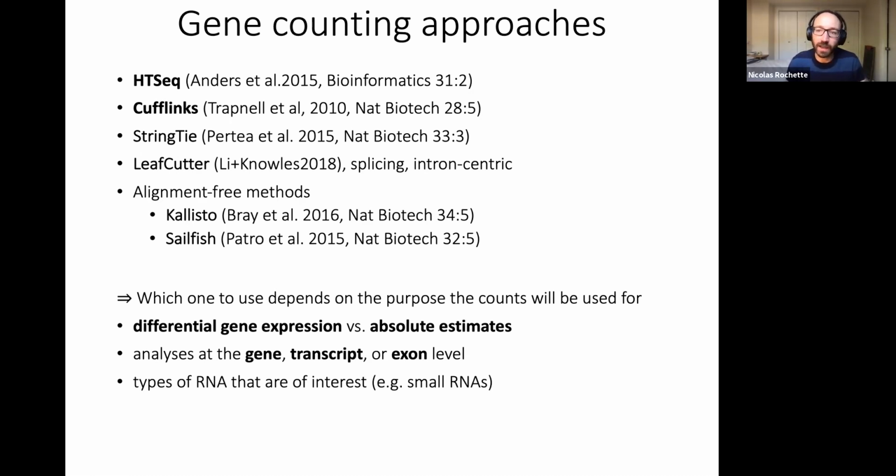They're not asking exactly the same questions, and they're much more reliant on having a well annotated transcriptome, but they allow us to save computational resources by trying to quantify directly, given an already annotated transcriptome, the expression of the genes from the reads without first aligning reads to the genome. These would be these two methods. I just want to mention that this approach exists.